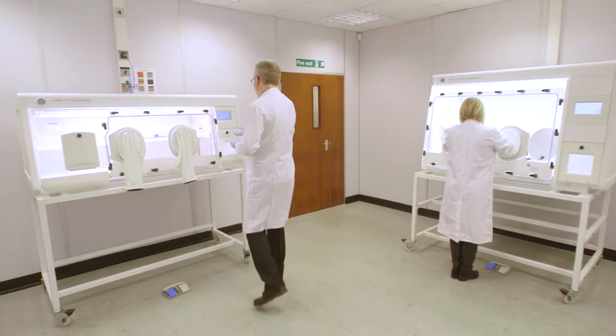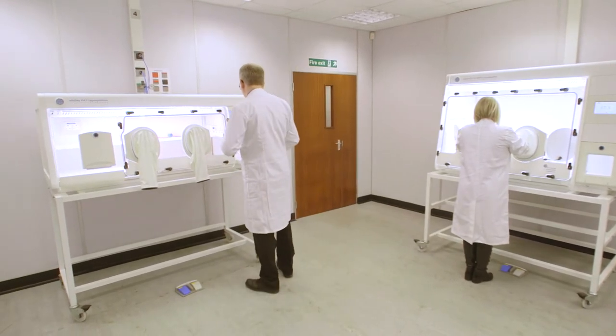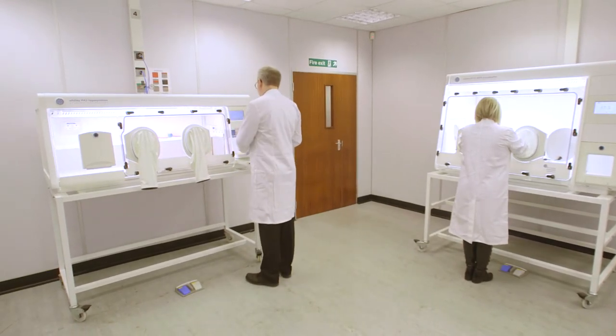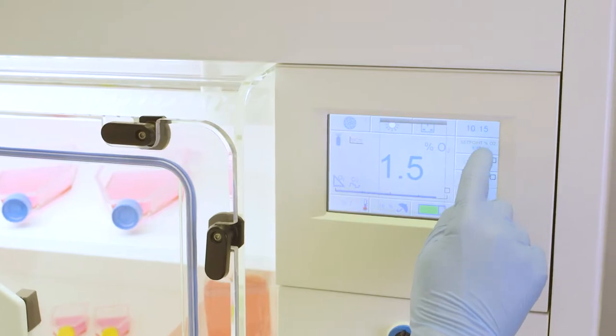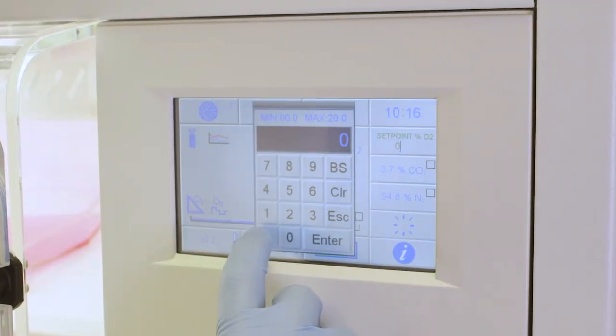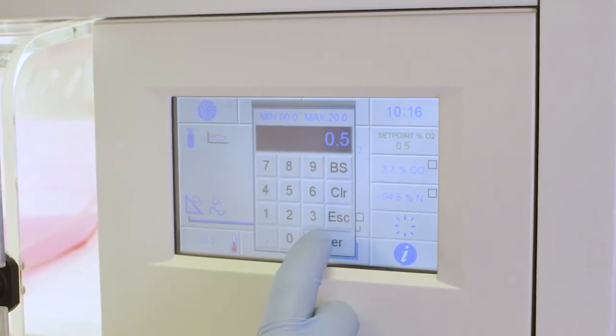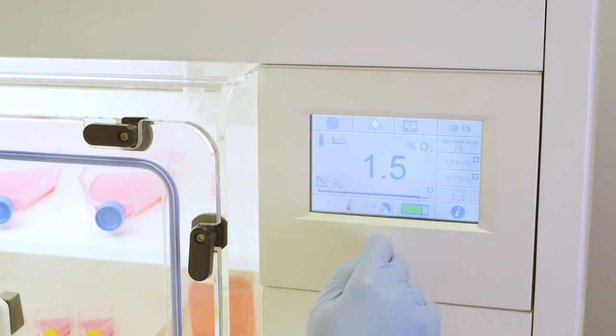Hypoxic stations allow the control of oxygen and carbon dioxide concentration in 0.1% increments. The sophisticated control mechanisms used in hypoxic stations allow the selected gas mixture to be rapidly and accurately attained and adjusted.